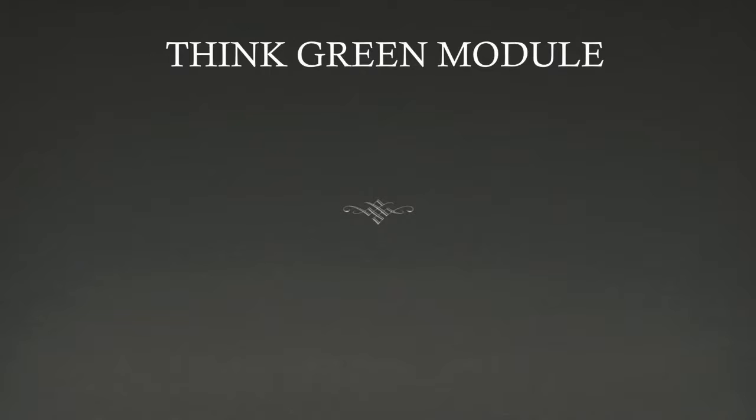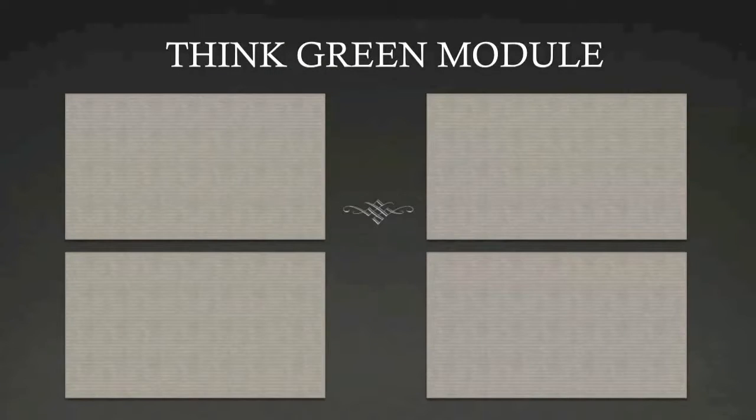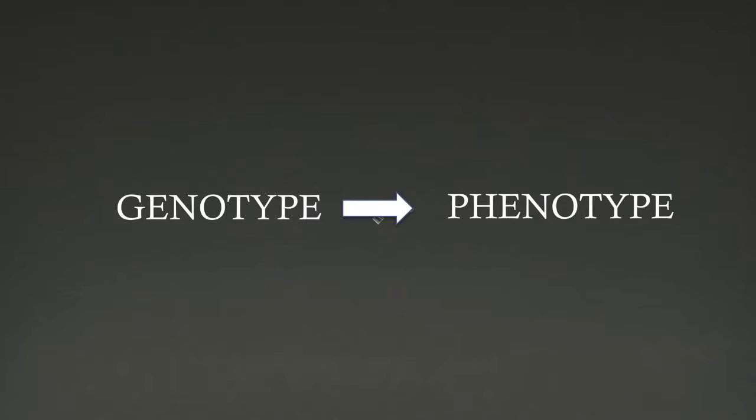www.abrcoutreach.osu.edu. The Think Green module is a compilation of 4 different experiments designed to teach you the relationship between genotype, phenotype, and environment. In previous modules, we have shown you that changes in the genetic code of an organism affecting its genotype can have direct and sometimes drastic effects on the physical attributes or phenotype of the organism.